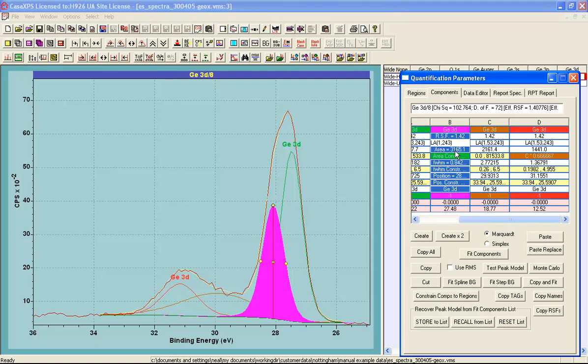What I'm going to do now is change the Voigt type function into a pure Voigt function by specifying the first parameter as 1 and the second parameter as a large number representing the width of a Gaussian that is convoluted with a Lorentzian. And this will introduce wings into the shapes of these components.